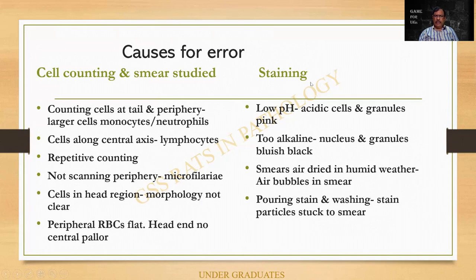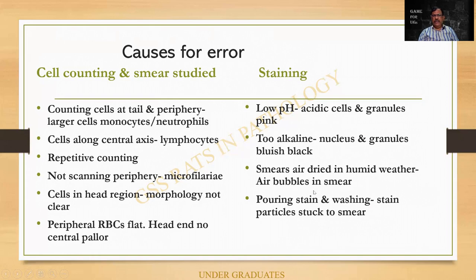Technically, errors can also occur because of staining. A low (acid) pH means all the cells appear pink — no blue granules are found. Too alkaline means they become dark blue or bluish black. Sometimes when the smear is air dried in humid weather, there can be air bubbles. A common mistake after staining is complete: the technician pours off the stain and tries to wash it under tap water — when you pour off, all the Leishman particles stick to the smear and you cannot get rid of them.